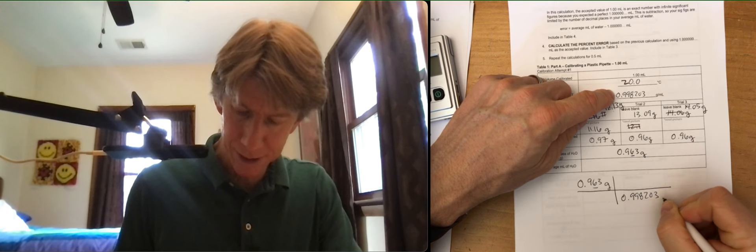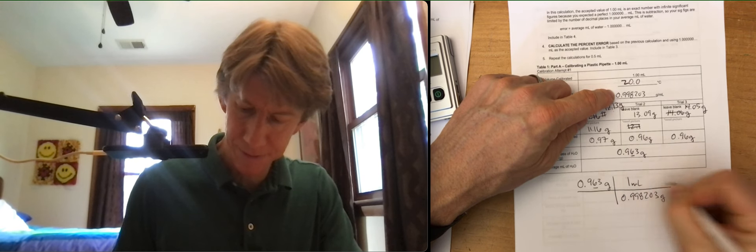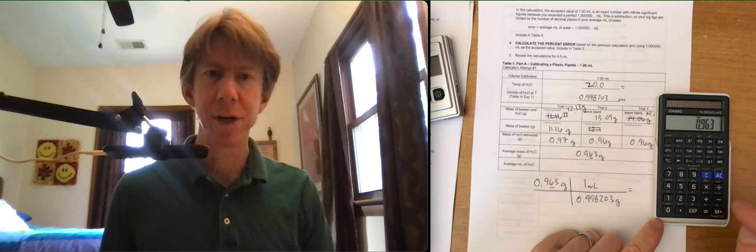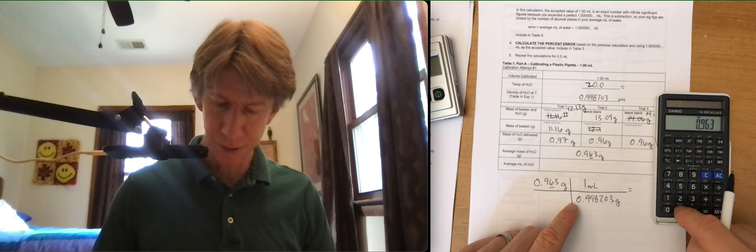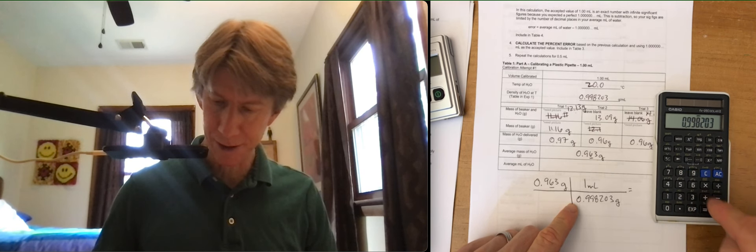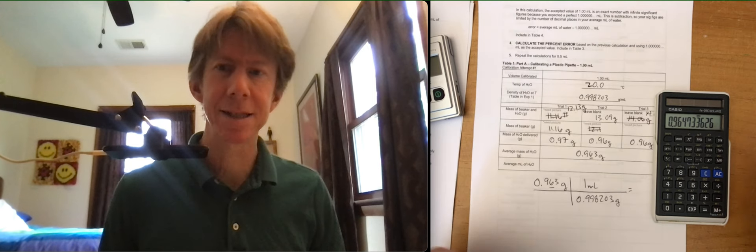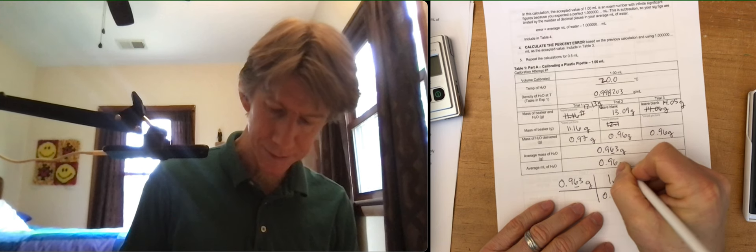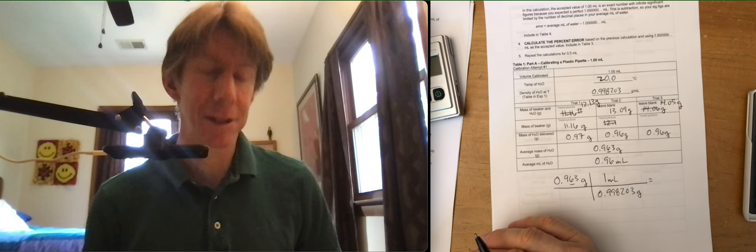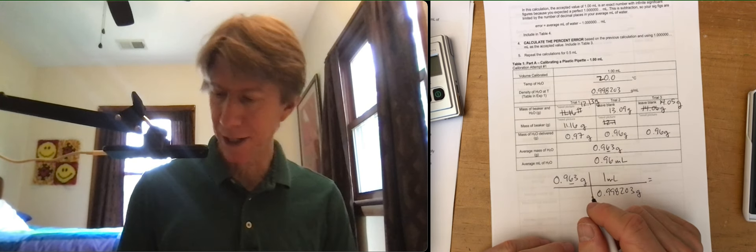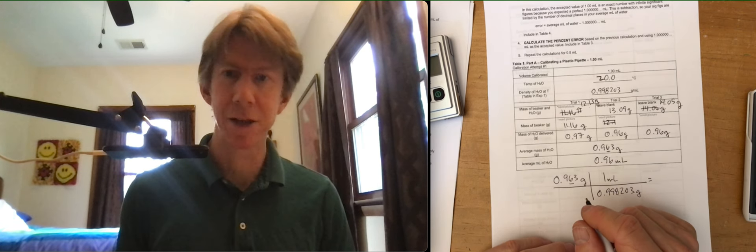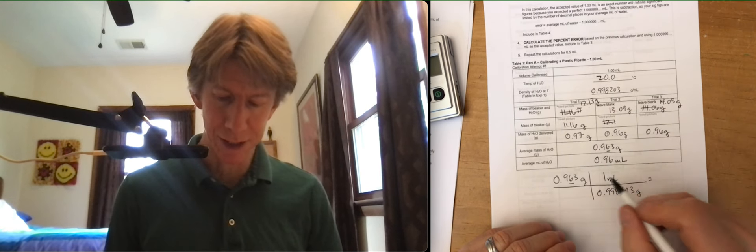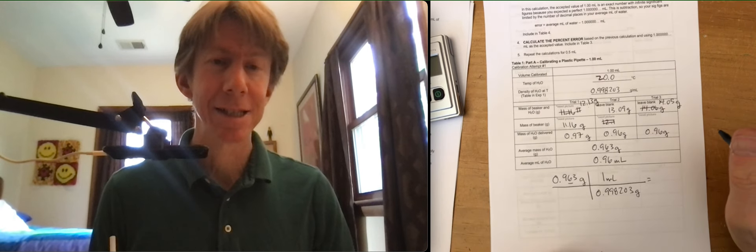I have my density, which is in grams per milliliter. 0.998203 grams per one milliliter. And now I can multiply this out. 0.963 divided by 0.998203. It's still 0.96 milliliters. To two decimal places. I guess I could put 0.965, since the third digit rounds to a 5. But I usually just write the two digits, so 0.96 milliliters.